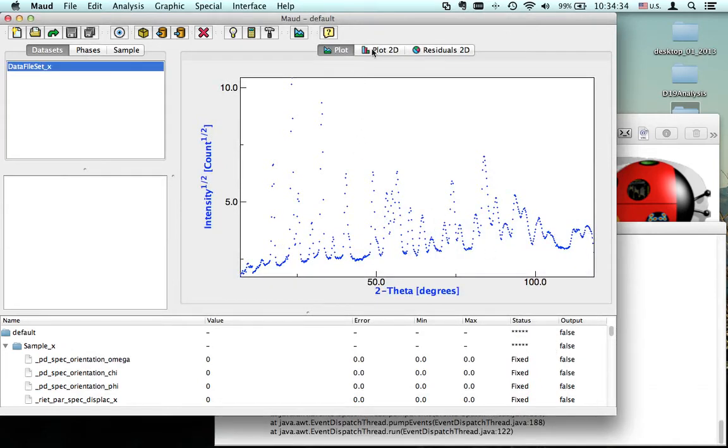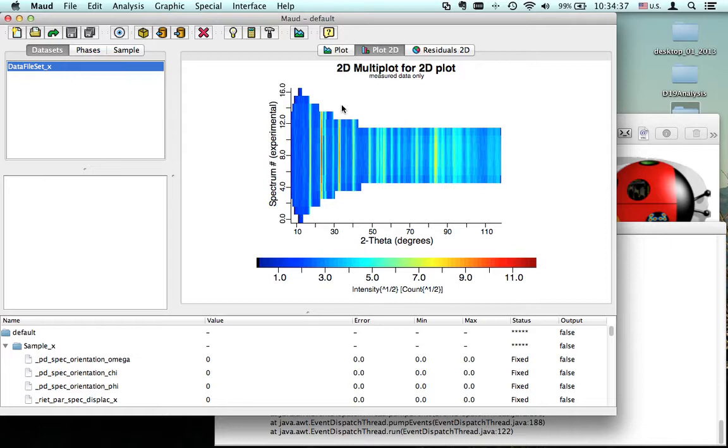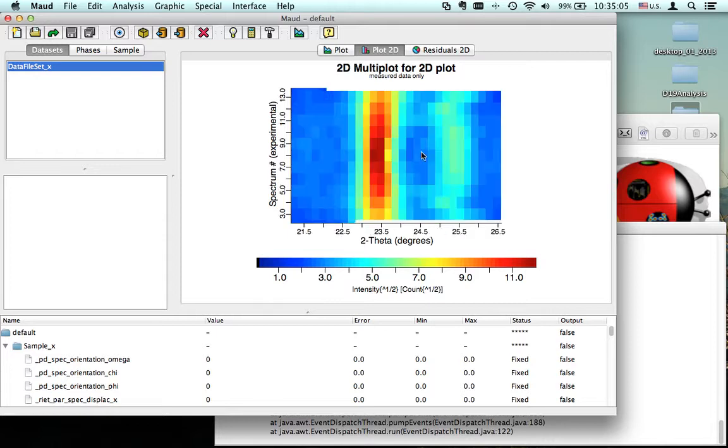Okay, here in 2D you see the pattern. You see still the minus plus 40 and probably also the minus plus 35 we can remove, they don't get the first diffraction peak. You see already the lines are pretty straight, they should not be really perfect. Over here is the point where there is the problem, the artifact I was mentioning, and still here you see where the line is missing, there are some problems.